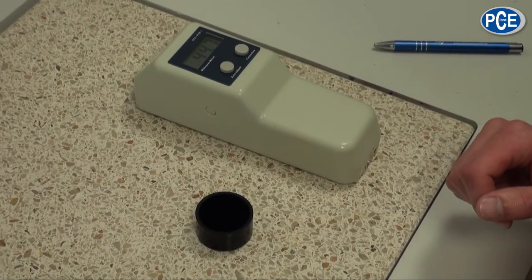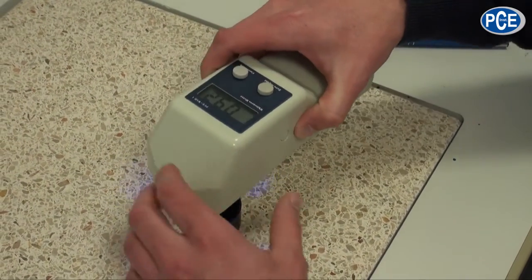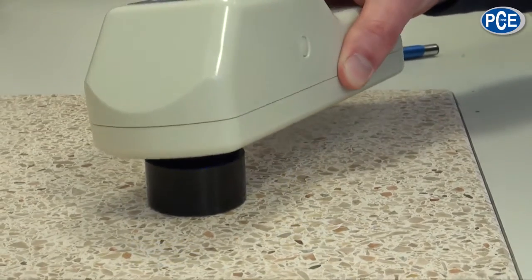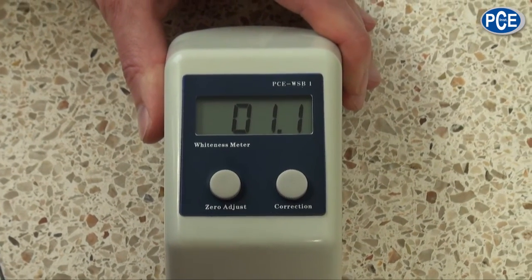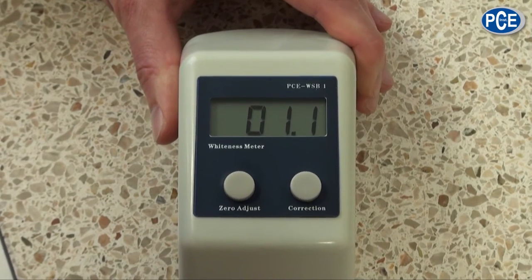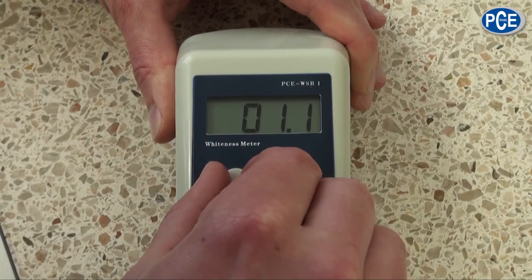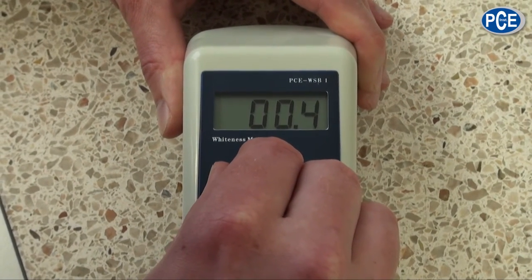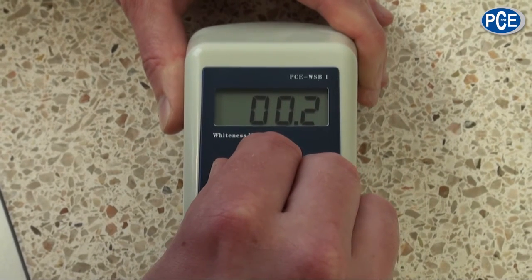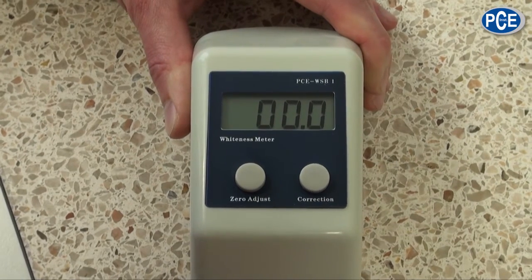We start with the black calibration. For this we put the measuring device with the opening onto the black standard. If the value varies from 0, we can set the value with the setting button. The black calibration is herewith made.